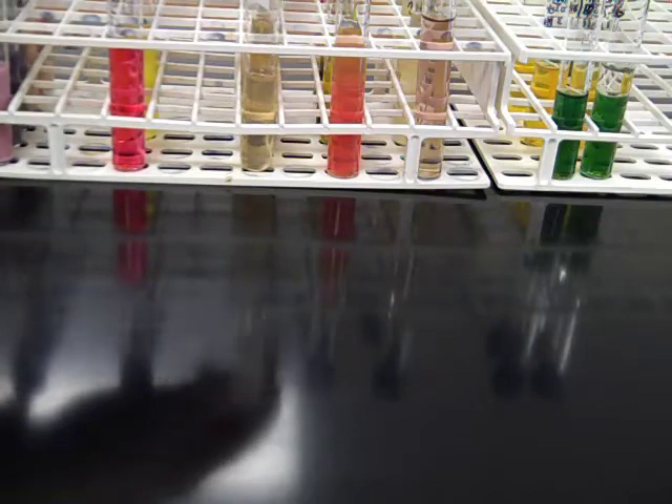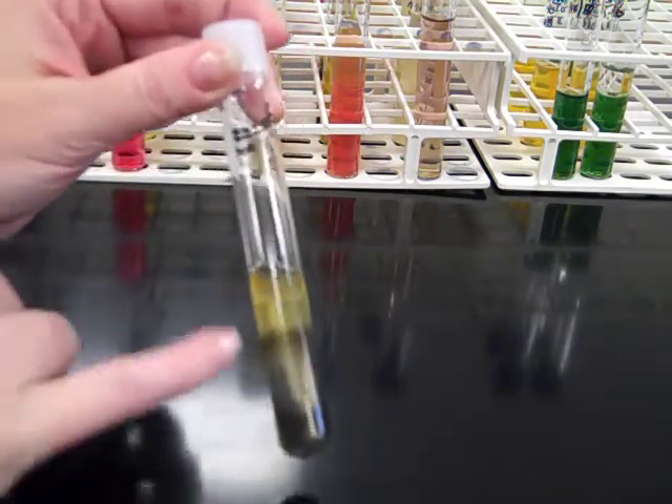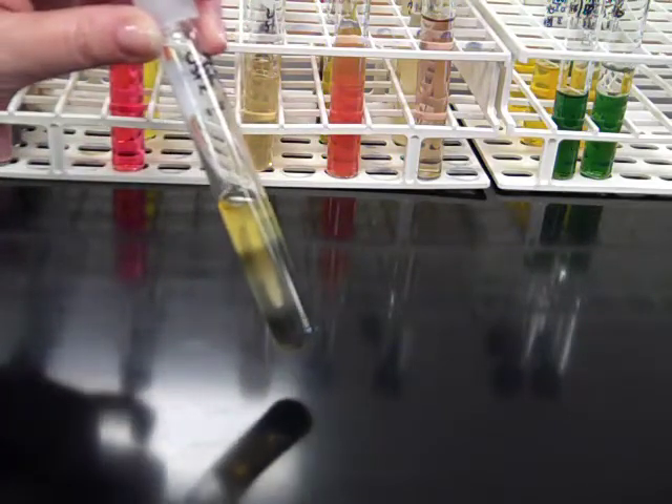The next thing we can assess in SIM motility is the production of hydrogen sulfide using the sulfur component. If there's a blackish precipitate or blackish cast to the tube, that's an indication that the organism can produce hydrogen sulfide — it would be positive for hydrogen sulfide.